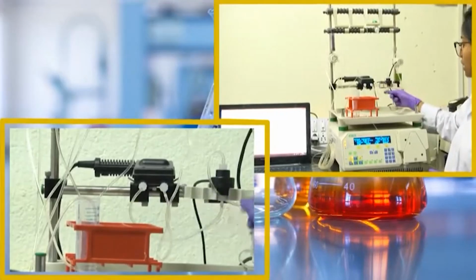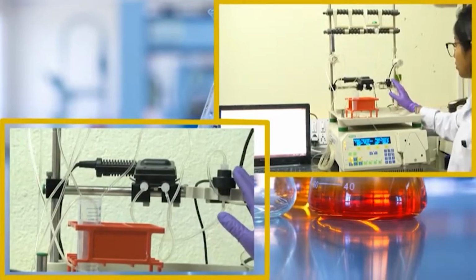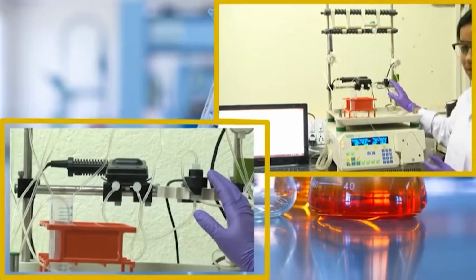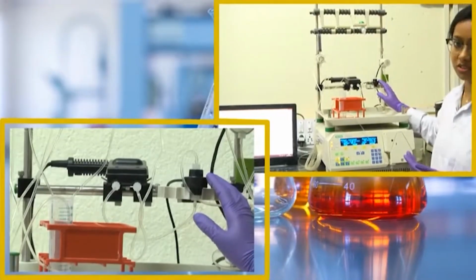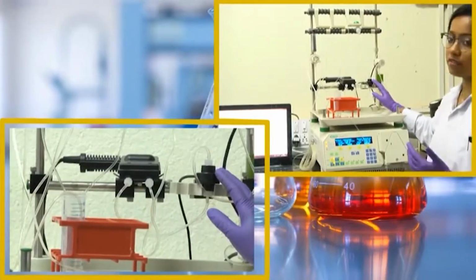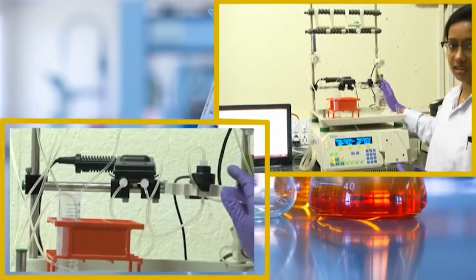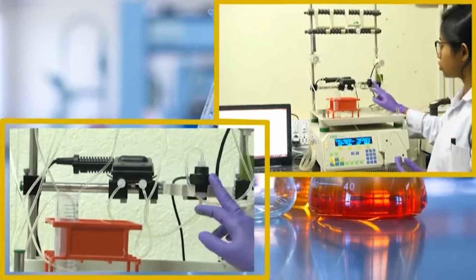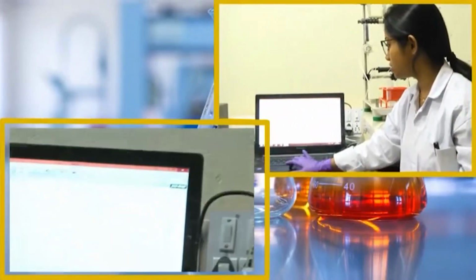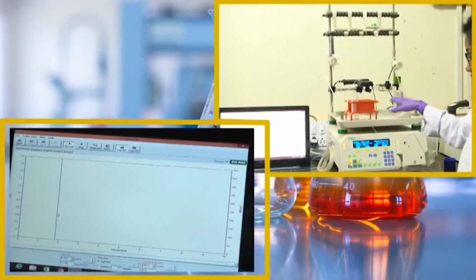Then it comes out, and this is a conductivity measurement instrument. It will measure the conductance, which means how much salt is present. For water it will be very low, but if you have a high salt concentration in a solution, it will show the conductivity of that solution. If you are going for ion exchange, like cation exchange or anion exchange, you can monitor that exchange as well. By using these two small instruments, it can show what is happening in there. So, for that we will go to record, and it will start recording the absorbance as well as the conductivity measurement.